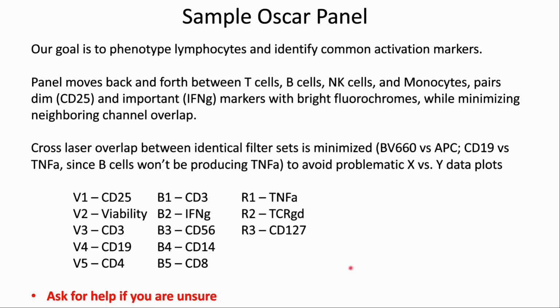Finally, we would suggest asking for help if you are unsure how to design your panel, as we will provide assistance and help you select markers and choose available channels on our instruments.